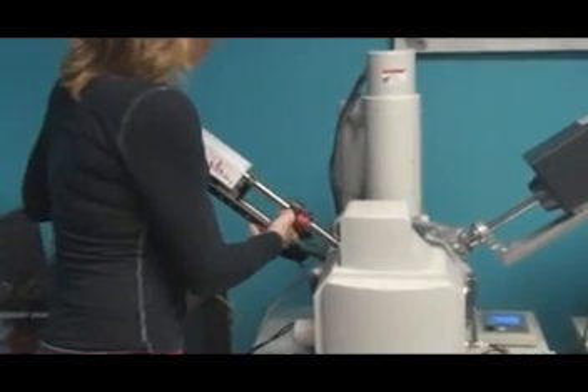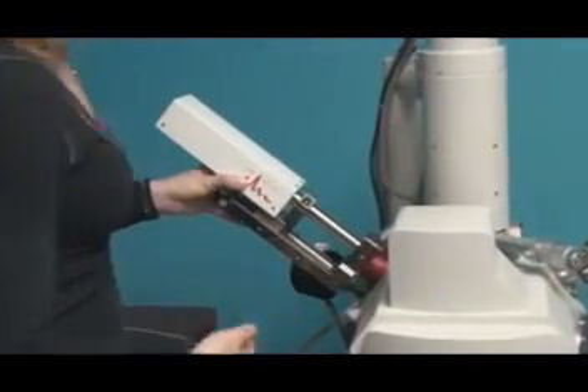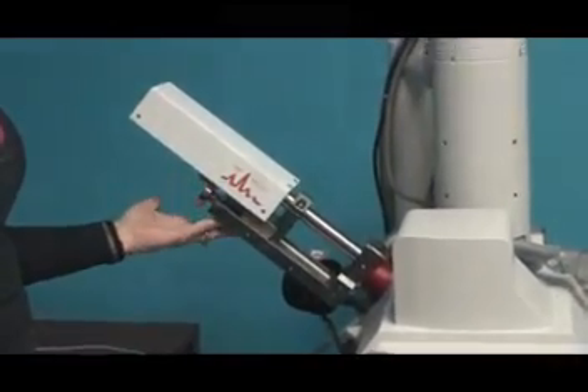The FX SIM tube can be interfaced to almost any SEM. High angle 35 degree, as well as horizontal flange mounts are available for almost every tube package.